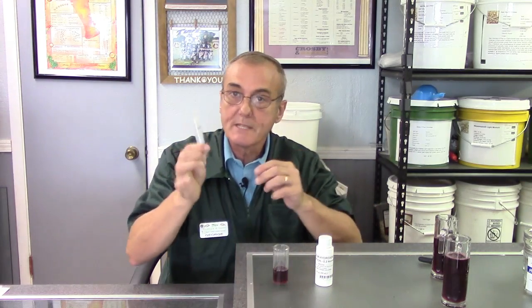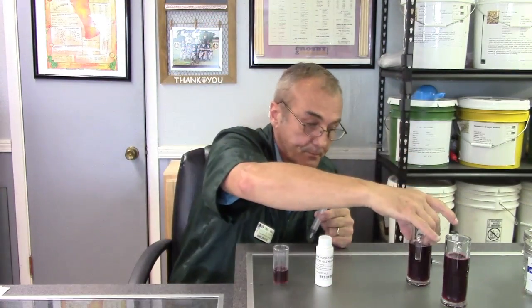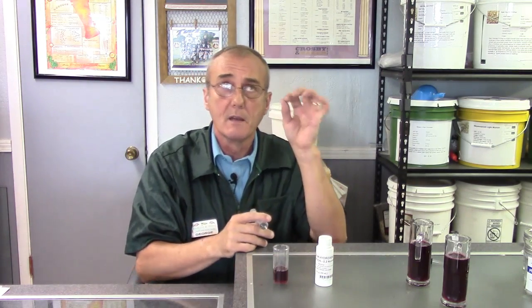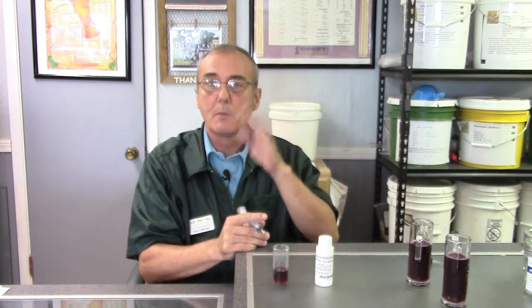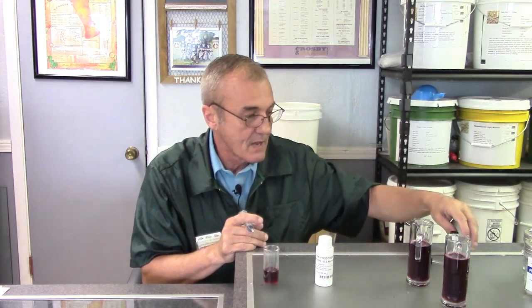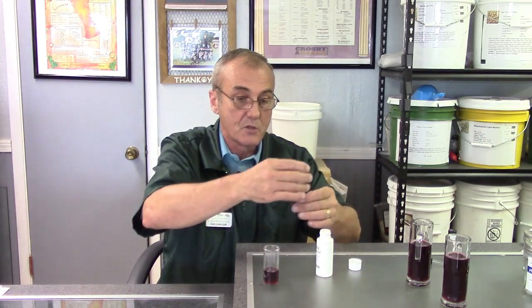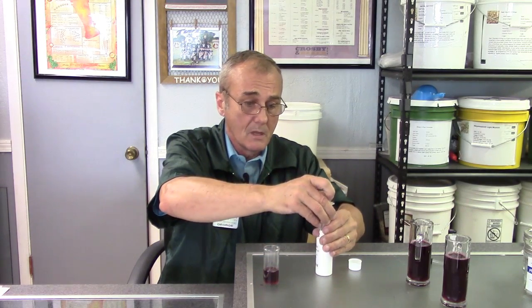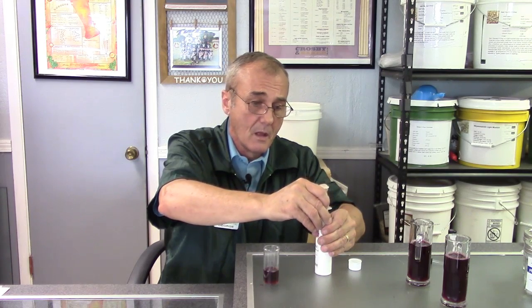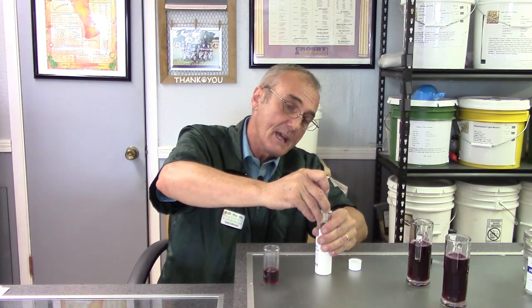So here we are — we've got 15 cc's of our wine must. This is before we add any yeast — we've only mixed it so far. We already know the gravity is 1.065 and the pH is 3.4. We've got 15 cc's and three drops of phenolphthalein. Now we're going to take the sodium hydroxide — the most dangerous stuff we're using — and draw up 10 cc's. We're going to introduce this one cc at a time.